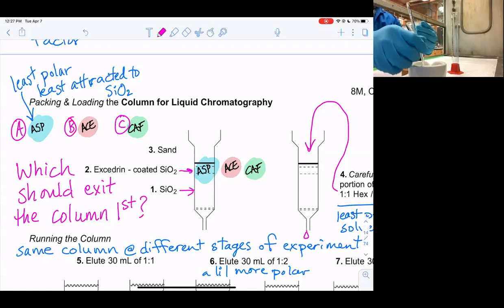I should have done it in a Buchner and then had a filter paper there. That's another way of doing it, yeah. That would be a little more clever. First rule of Fight Club, guys. Work smart.